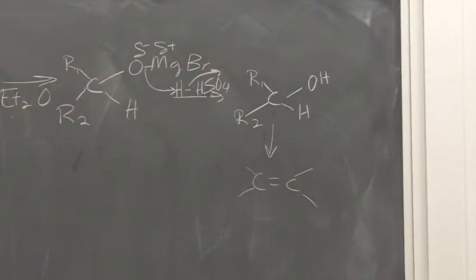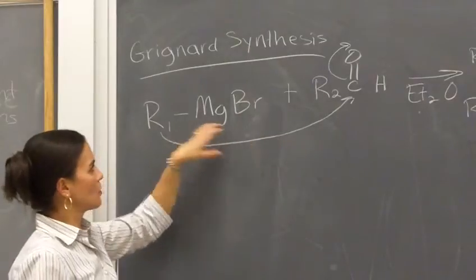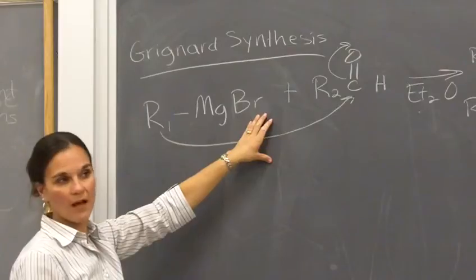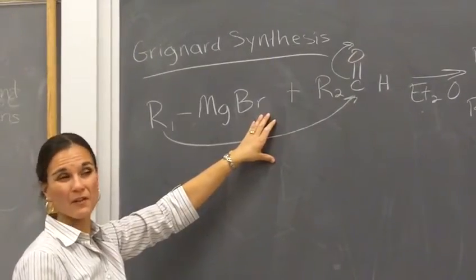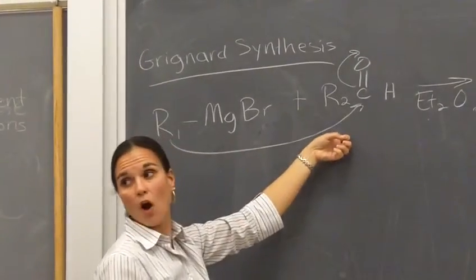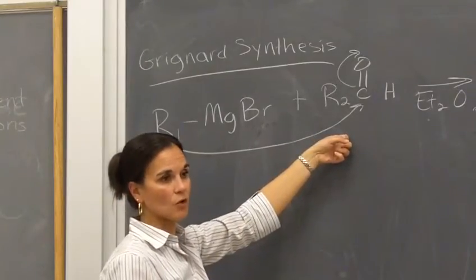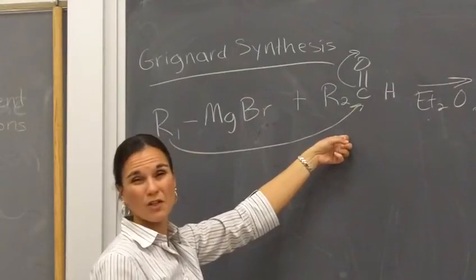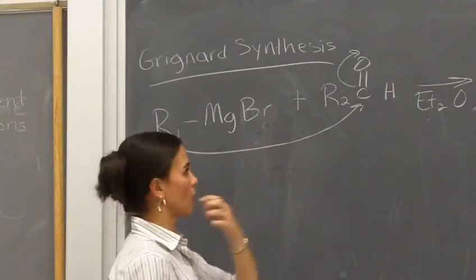So we're first going to be adding our aldehyde to our Grignard reagent. This again is going to be dropwise, okay? So make sure when you go to put your aldehyde in your separatory funnel, you've got the stopcock closed. This aldehyde solution is already prepared for you, okay? You're going to measure out 25 milliliters of the appropriate aldehyde solution. Make sure you read the labels carefully. There's 4 alkyl bromides, 4 aldehydes, so you got to make sure you pick the right one.